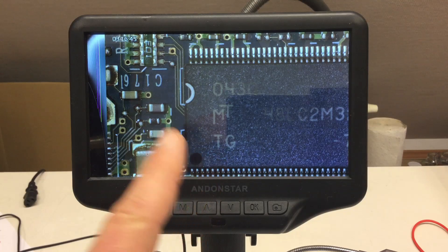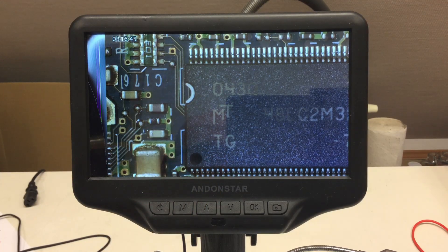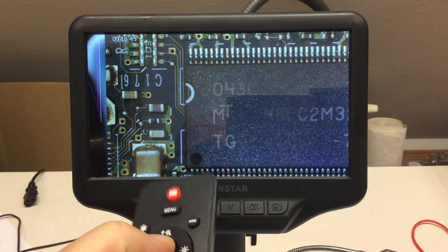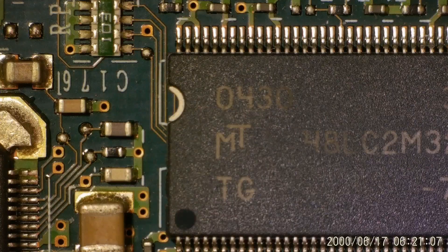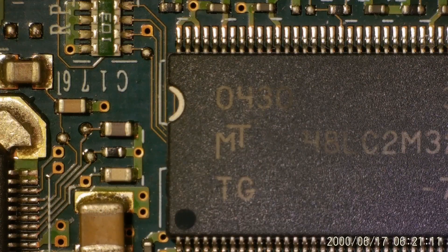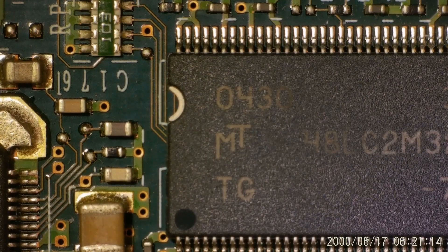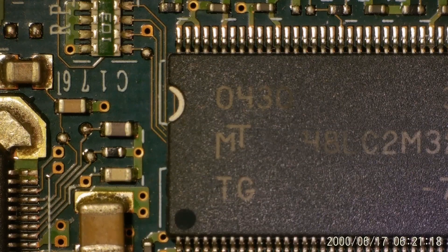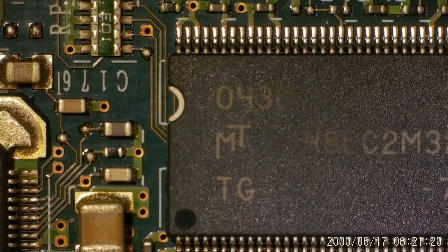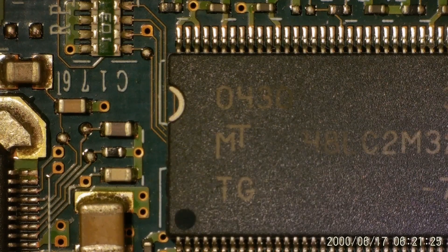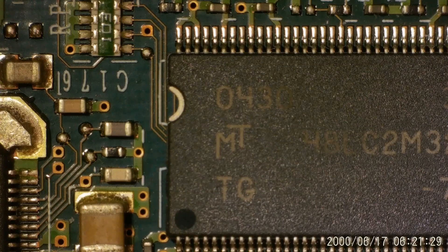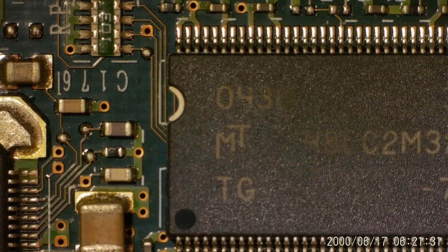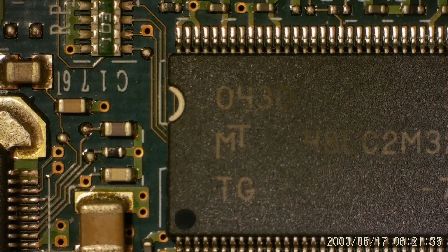And now we have a look at the screen, and I will also do a capture. Okay, with polarization, and I will start capturing now, hopefully. So there's not much to see, and I'm turning now the polarization film in front of the lens by 90 degrees, slowly. And we see, basically, nothing changes.